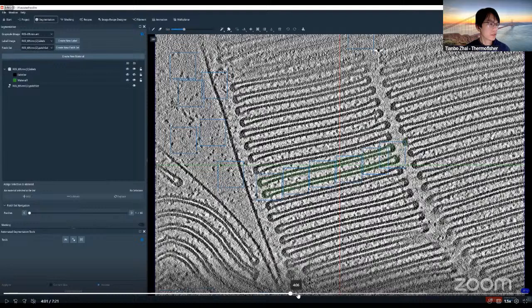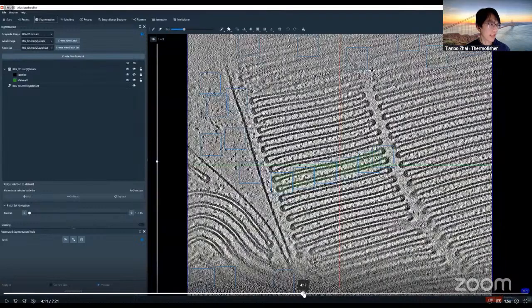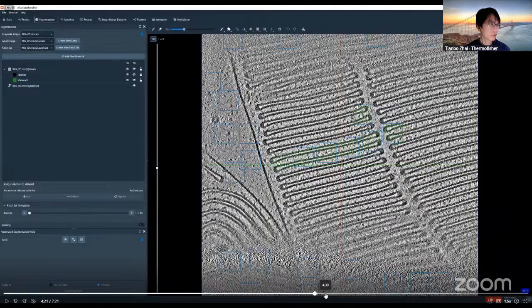And then from there, we're going to annotate. Multiple ways to annotate those. I will show in the live demo. The brush is one of the most convenient ways, of course. And then for every single small square or small patch, we want to make sure the structure of interest, if it exists inside, is being properly annotated.